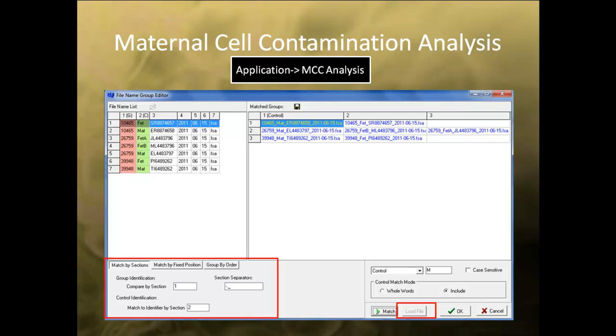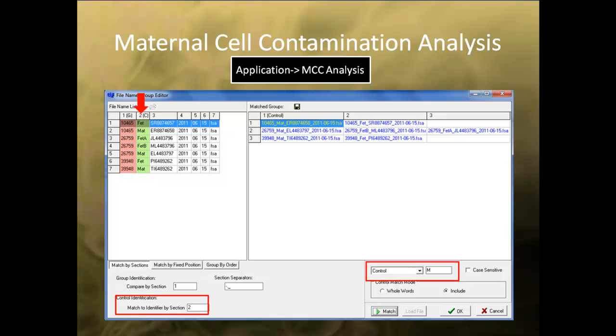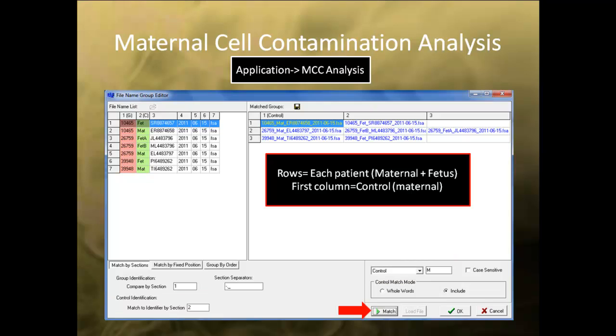In this example, Section 1 is my patient ID, which I am using to define the number of groups. Section 2 is my control identifiers, which are the maternal samples. Click Match to group the samples. Each row corresponds to a separate group or patient, and the first column is the control sample and should be the maternal samples. Click OK once you are satisfied with the groups.